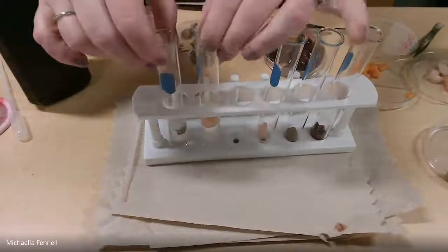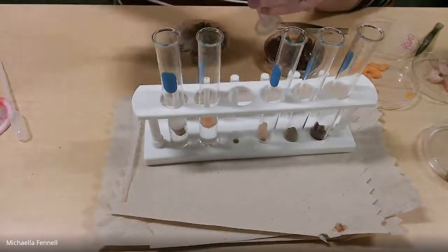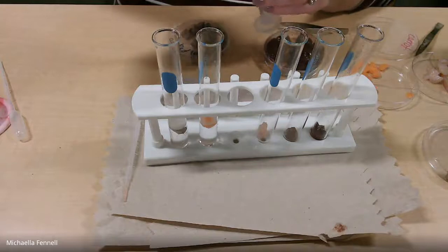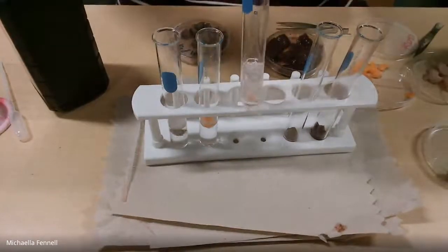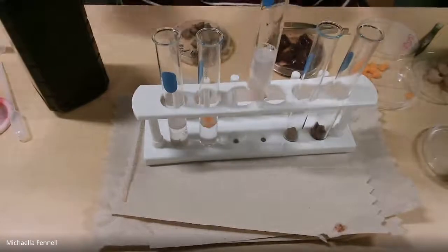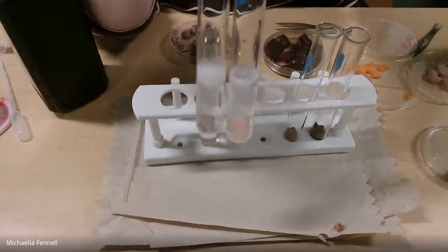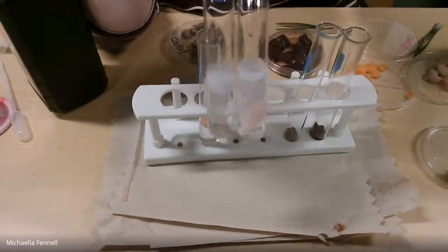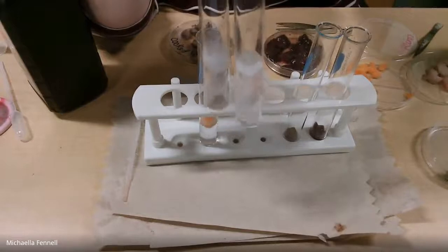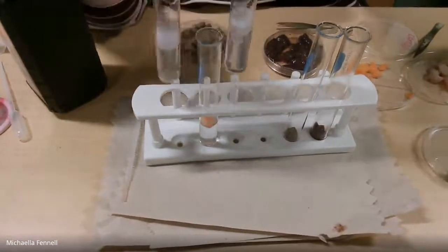Then we've got the raw chicken. Ooh, the kids are coming back from lunch, you guys, but that's okay. All right. Let's see what you think. Does raw chicken have more or does potato have more? This is the potato. This is the raw chicken. The potato has more than the chicken. Same amount of time, we should have put as a constant variable too. We'll check these back in a minute or two here.